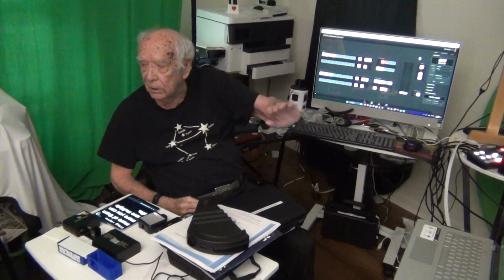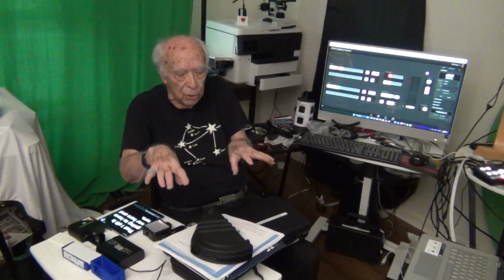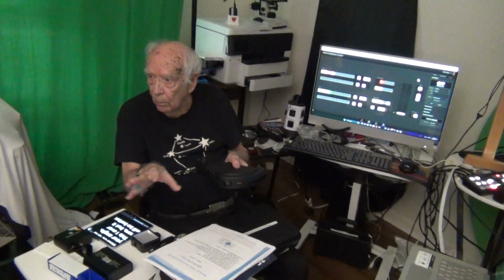And then you may have more of them. You can have multiple slits. You can have 2 slits or 5 slits. But we're going to be working with a 1 slit. That 1 slit is going to have over here and here. And then you have a choice with your software which one you're going to pick up. Sometimes depending on the light source and your angle, this one over here will be better than that one.